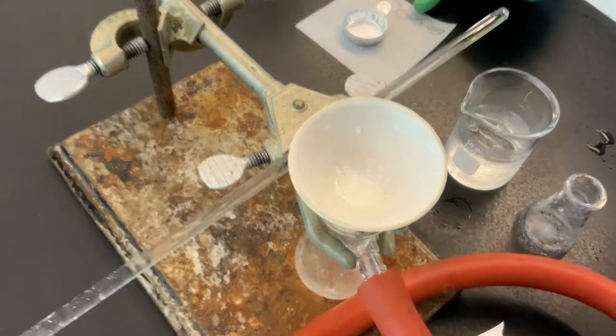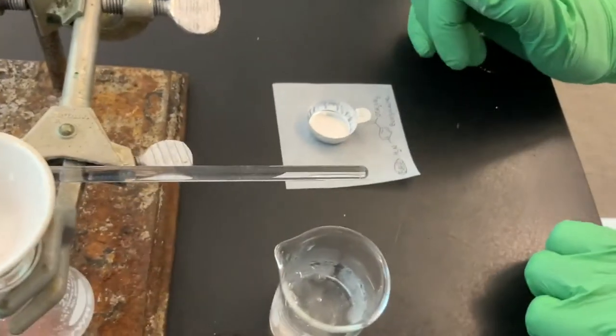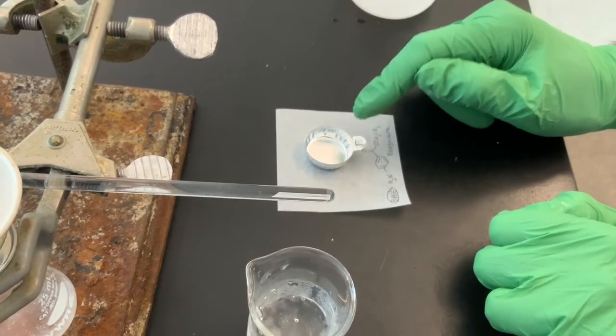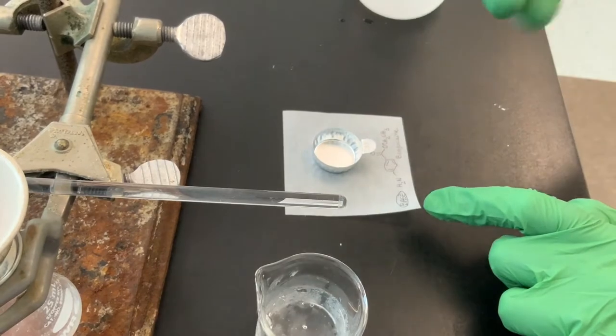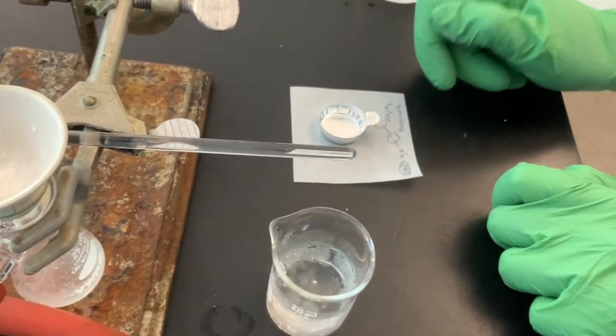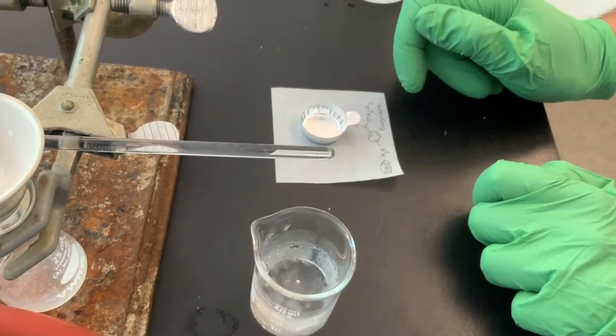Over here, just adjacent, this is our tared aluminum weighing dish. We have the data already written down. We have the tare weight of this. And so eventually we'll get this dry as we complete our experiment. And then we'll measure how much benzocaine we've isolated.